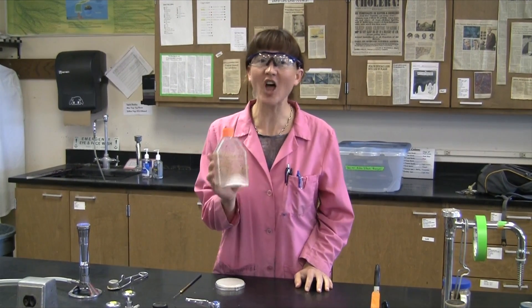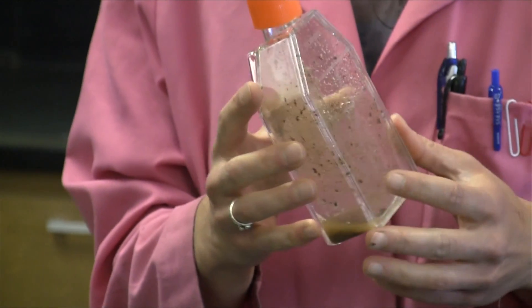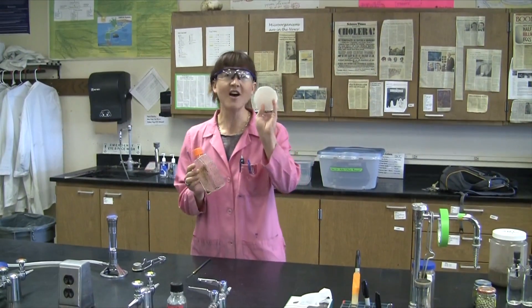So in this bottle now we've got a plethora of different things that are growing simultaneously, and it would be nice to be able to isolate them into pure culture. So today we're going to take a single loopful of this broth and put it onto a nitrogen-free agar plate.